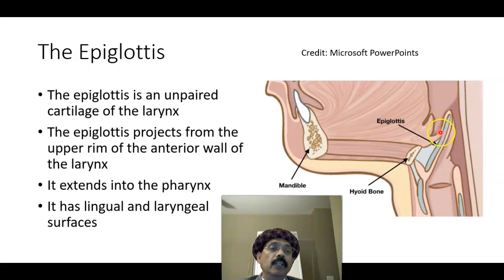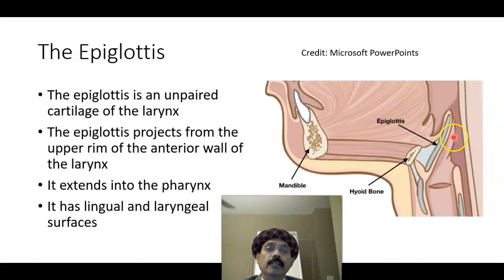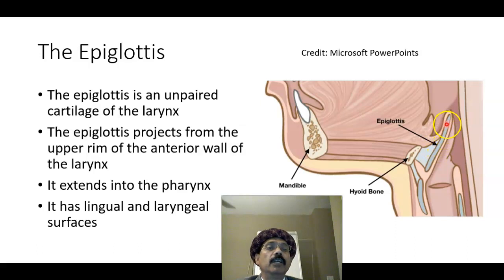This is the lingual surface and that is the laryngeal surface. This is the plate of cartilage — this is the elastic cartilage here.